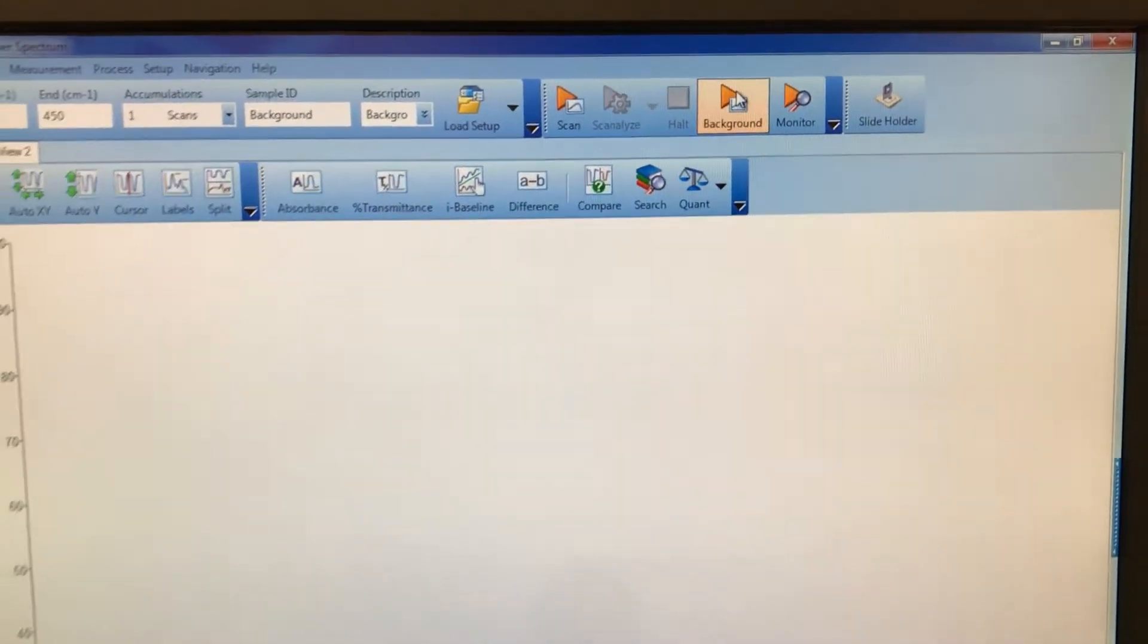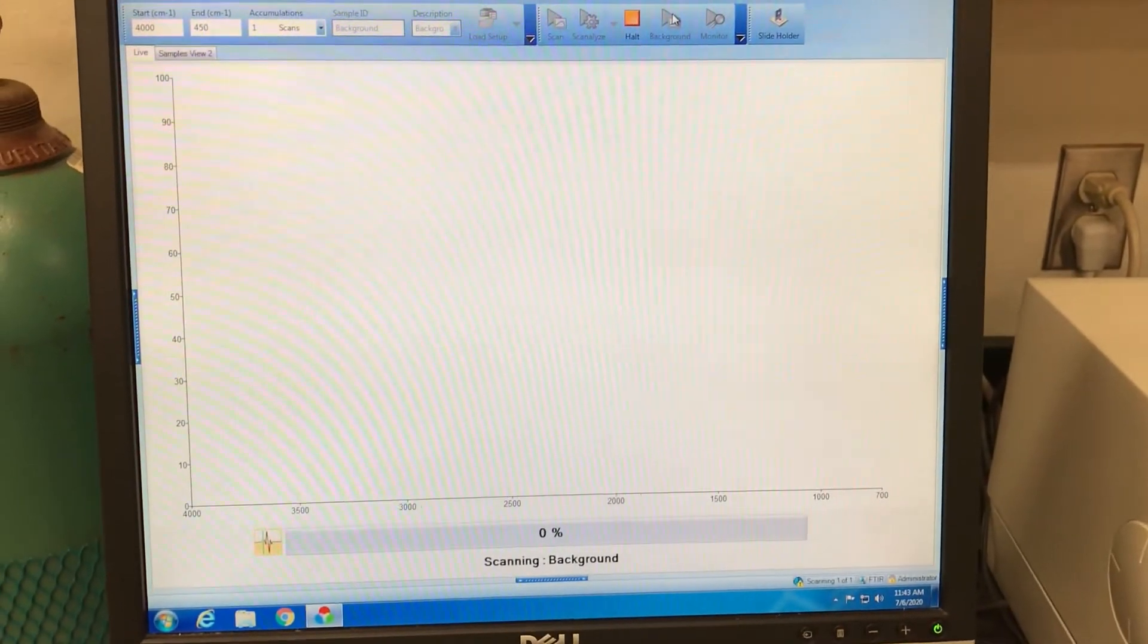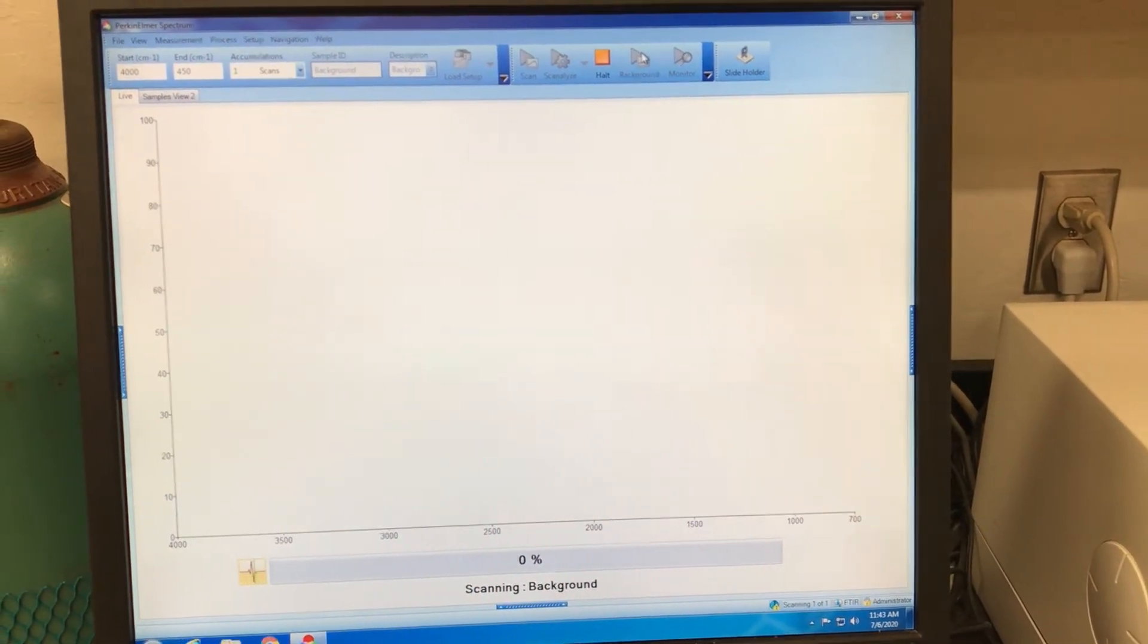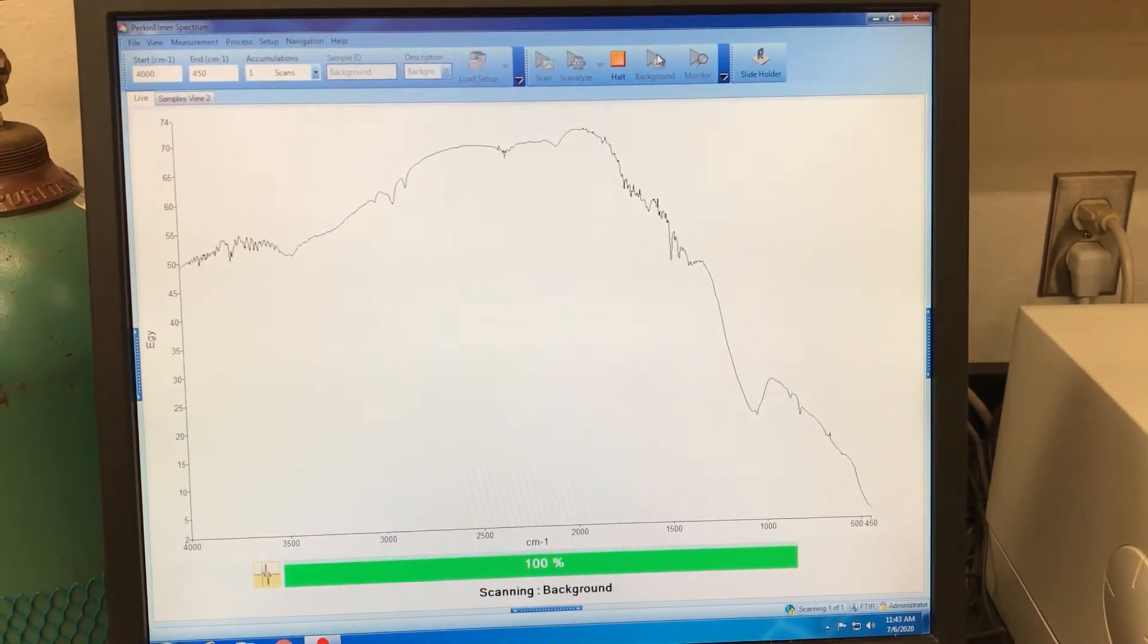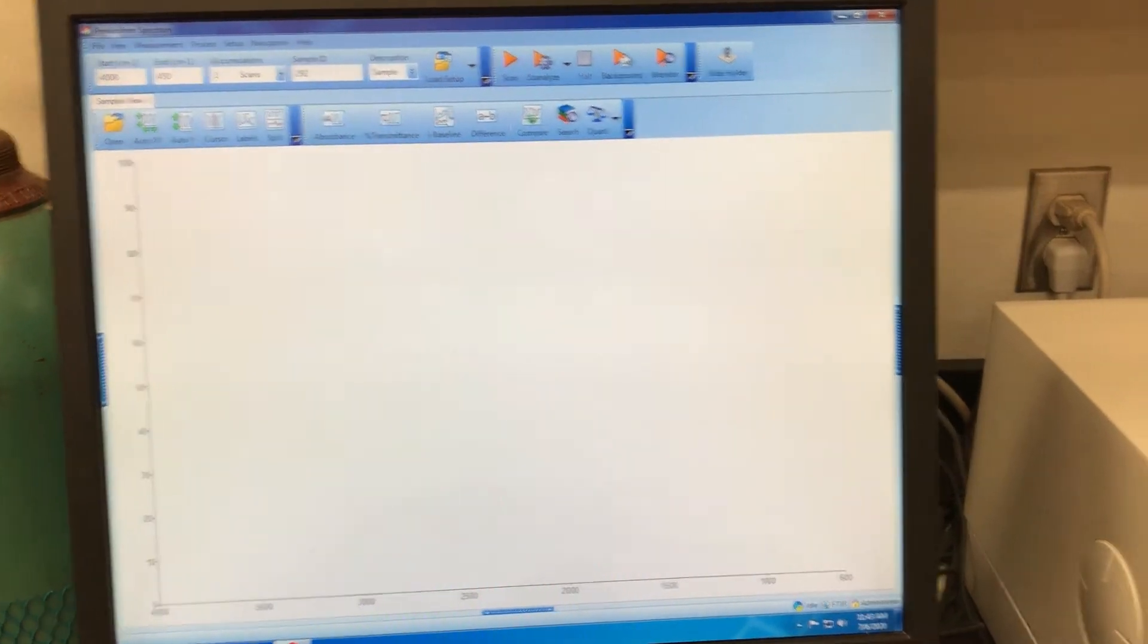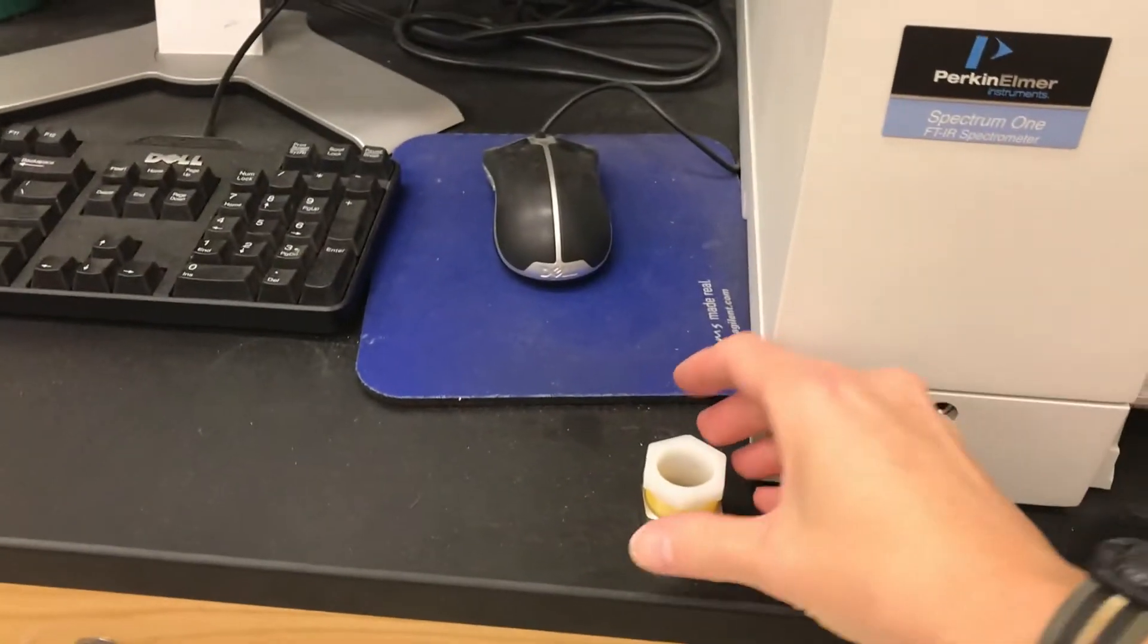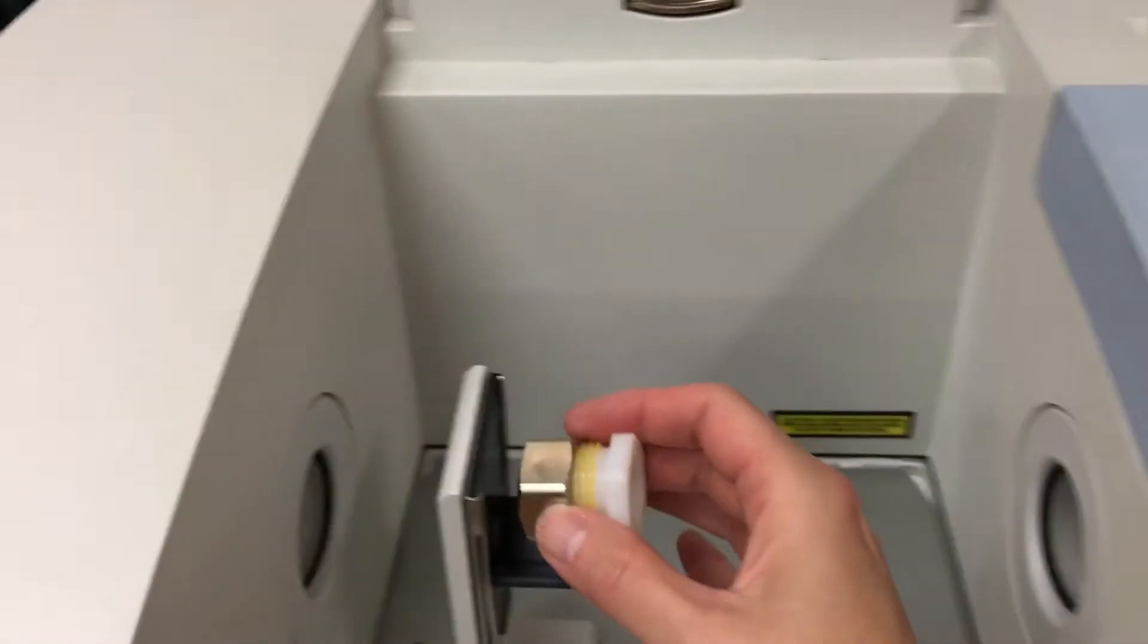What that'll do is it'll take an IR of the air that's inside of that instrument and it's very quick because what you next do is then you open it up and then you put your sample in there and you place it on that black holder.